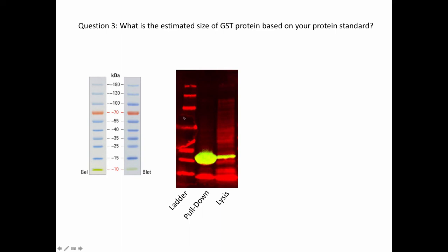You'll notice that this is going to be difficult for this gel because we actually have a bubble, and this is what a bubble looks like during that blotting procedure. The bubble can create artifacts so it makes your gel a bit harder to read. But we can still analyze this gel using this ladder. What you want to do is look at your ladder and figure out where these bands correspond to the ladder. My recommendation is to always start at the top because sometimes you won't see the bottom 10 kilodalton band. Sometimes you think that this might be the 10 kilodalton band when it's not if you try to count upward.